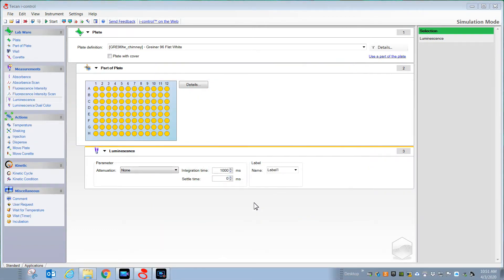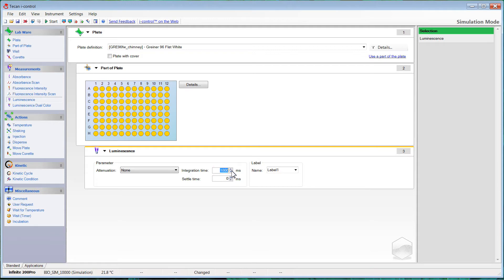The setup for luminescence on the Infinite 200 Pro readers is very simple because the photon counting detector requires no gain adjustment whatsoever. All you need to do is select the integration time per well, decide whether or not you're going to need attenuation, and note that we will never use settle time for a luminescence measurement on this reader. The default is 1000 milliseconds per well, which will work for most applications. However, if your signals are greater than about 200,000 to 300,000 counts per second, you can use a lower integration time of around 100 to 500 milliseconds.